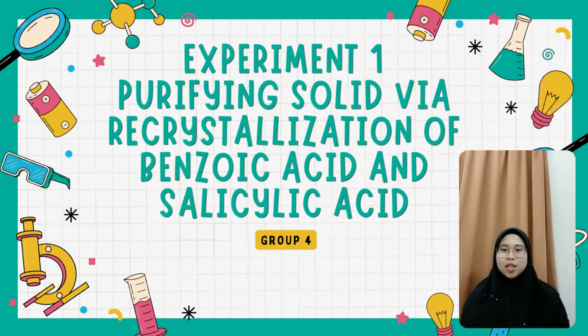Assalamualaikum and hi. In this video, me and my team want to present about experiment 1, purifying solid via recrystallization of benzoic acid and salicylic acid.